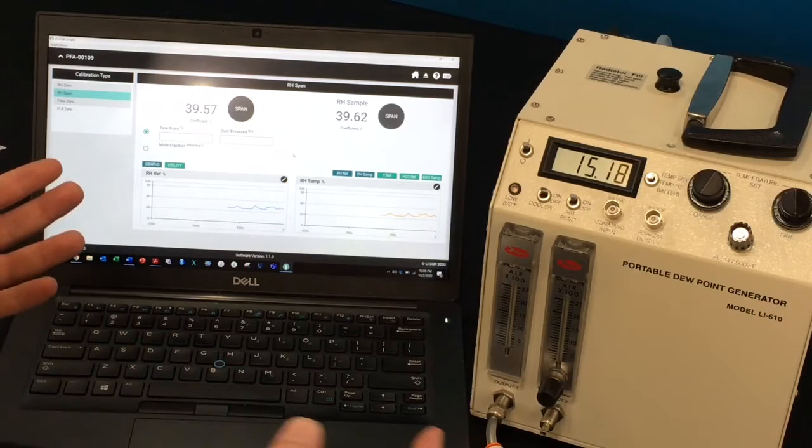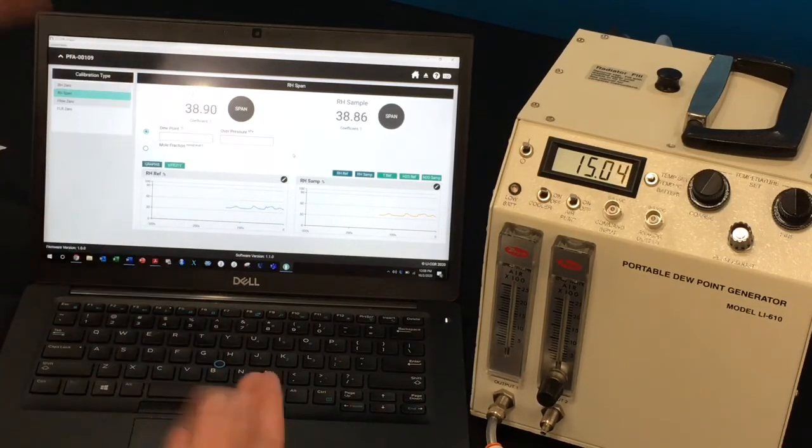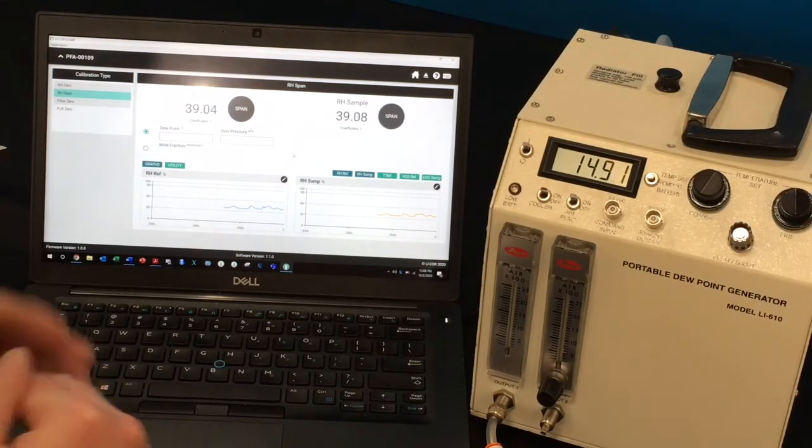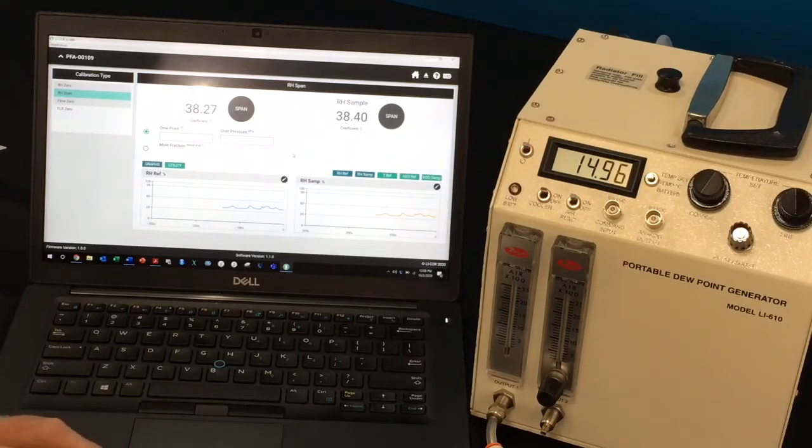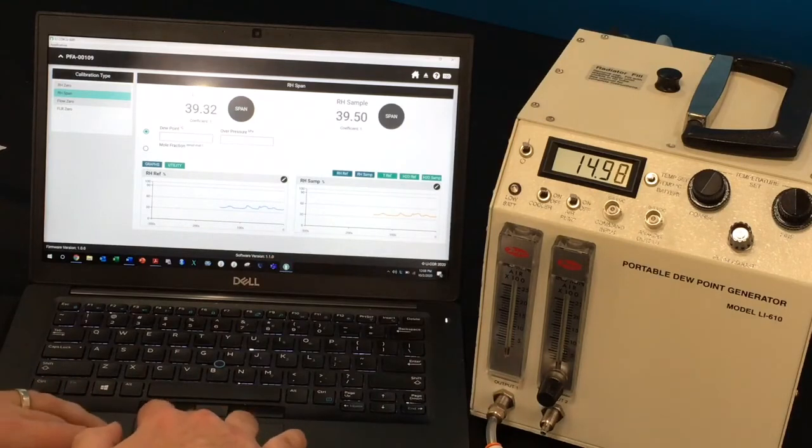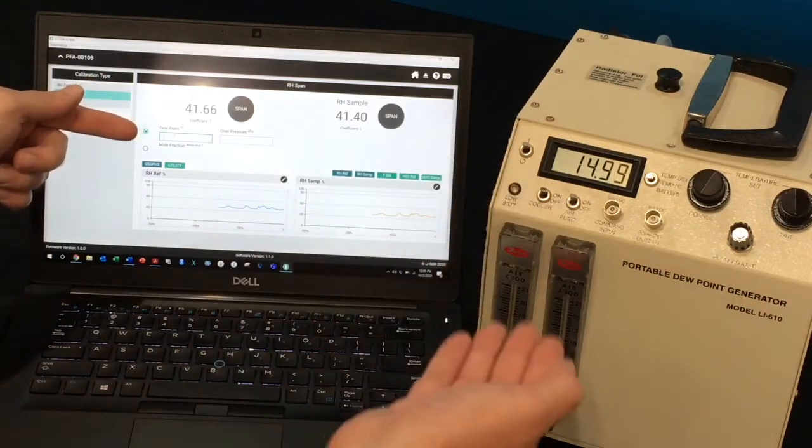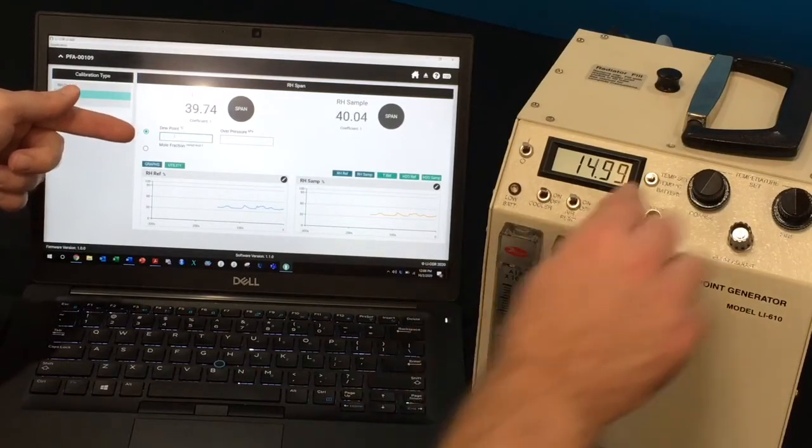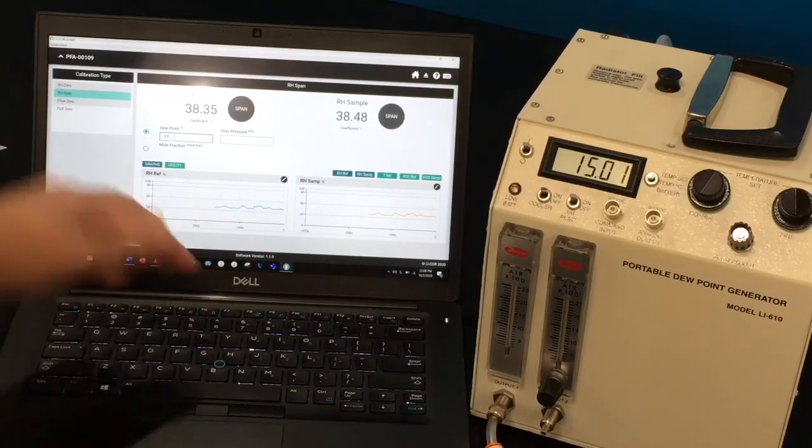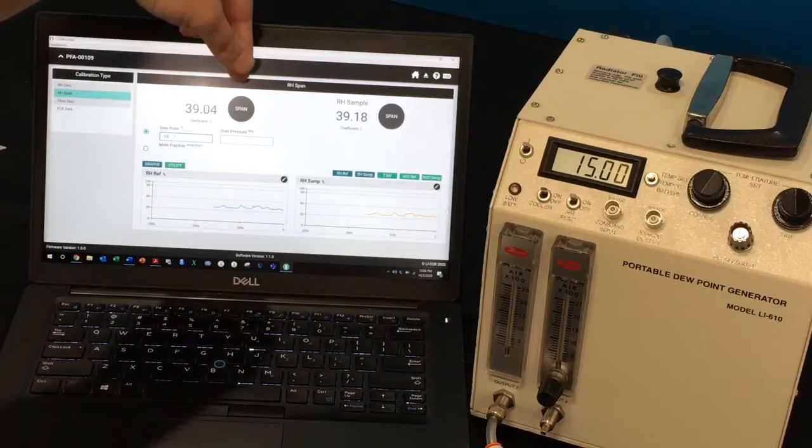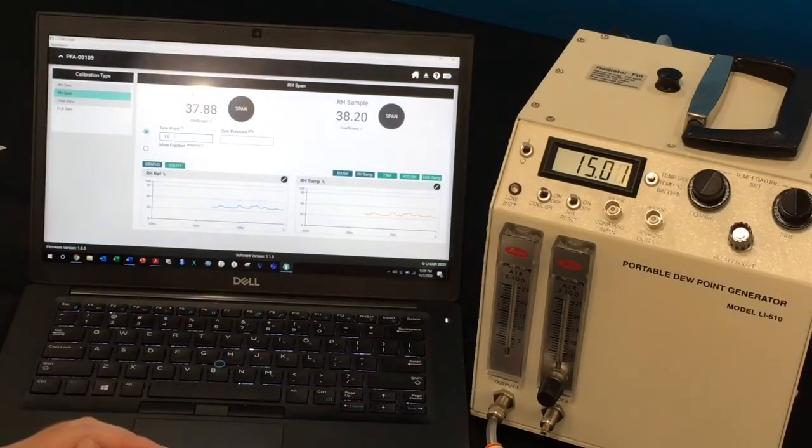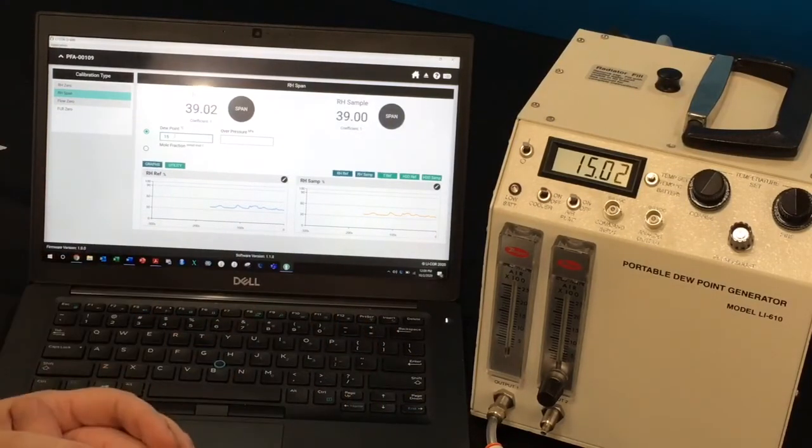After letting this run for about 30 minutes, I would recommend changing the scale on the graphs to a more finer resolution. That way you can truly see when the relative humidity readings actually reach stability. Once they have reached an asymptote and leveled off, you can enter the dew point that you've set on the LI-610 itself. In my case, just about 15 degrees. So I would type in 15 and then click on the span button for each relative humidity sensor to set those relative humidities to read correctly.